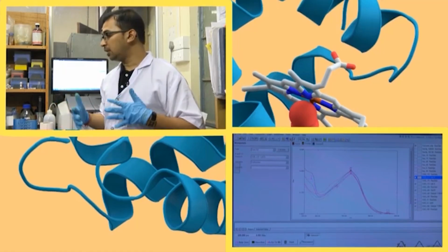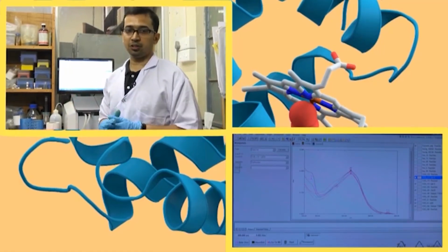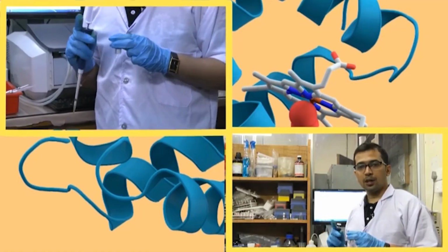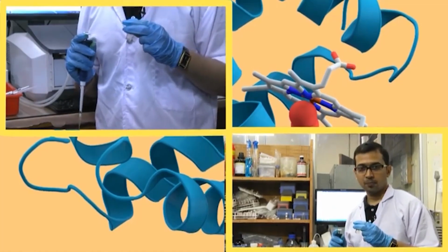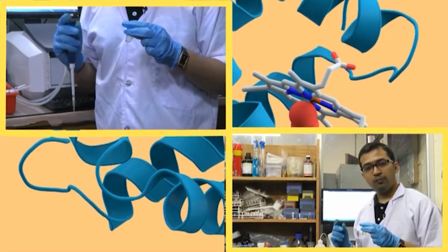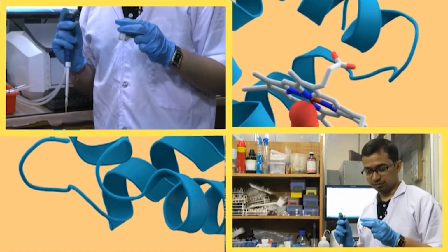Now, we will see how the changes in the gallic acid occur in presence of HSA. We had seen how the changes in the curcumin spectra occur in presence of HSA. Now, the next ligand which we are interested in is gallic acid. Here we will see a few changes in HSA spectra. Okay. First, we have to take the UV absorbance of gallic acid.